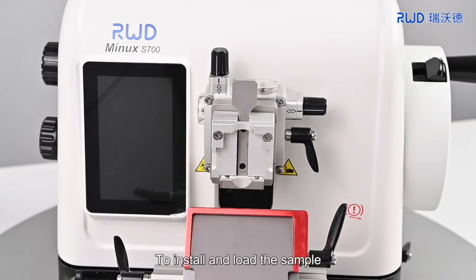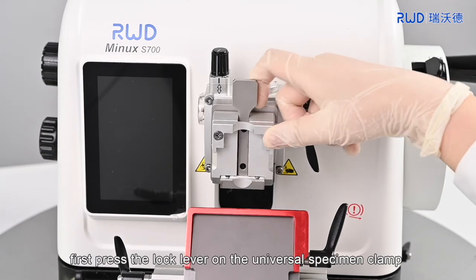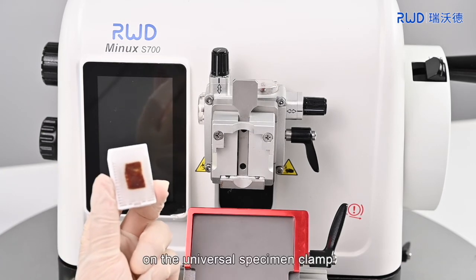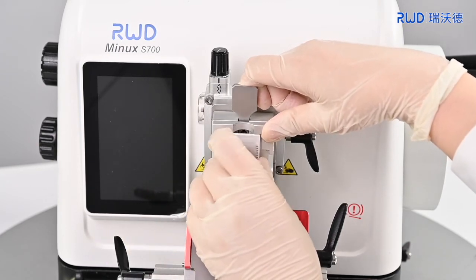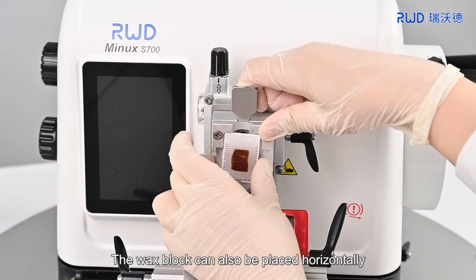To install and load the sample, first press the lock lever on the universal specimen clamp and install the wax block prepared in advance on the universal specimen clamp. Then loosen the lock lever. The wax block can also be placed horizontally.